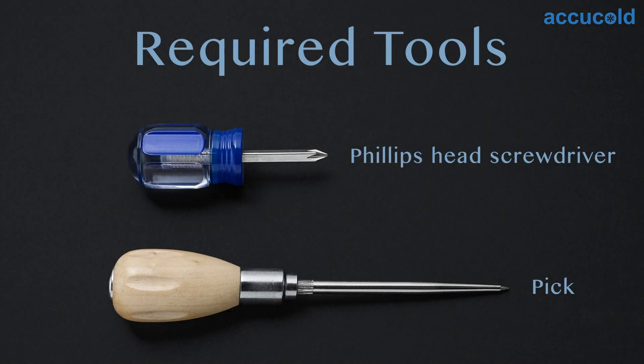Removing the device and probe requires two tools: a small Phillips head screwdriver and a straight pick.